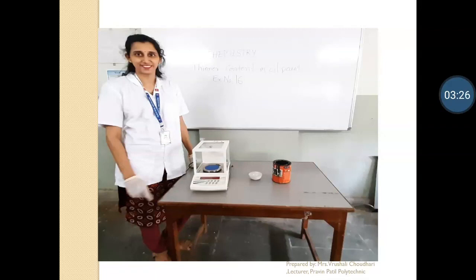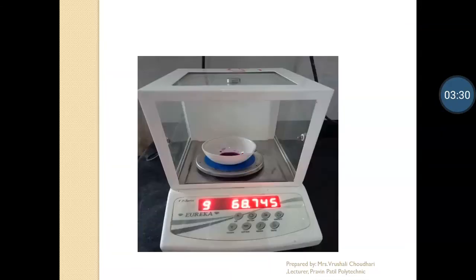We require the oil paint, the crucible, and the electronic balance. Here I have taken a sample and I am going to note down the reading, the weight of paint plus crucible, in an observation table. This is the electronic balance. The white color dish is called a silica crucible or porcelain dish. In that we are going to add the paint.